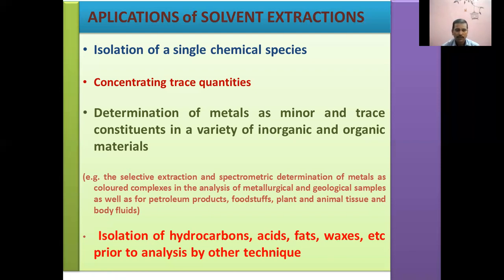Not only the metals, any material, any solute, any analyte whose quantity you intend to determine can be subjected to liquid extraction. For example, take a urine sample or blood. Suppose we are interested in determining the quantity of urea present in urine, or urea in blood, or uric acid in blood, or creatinine in urine. We have to separate all those endogenous substances. How to do this? By solvent extraction.